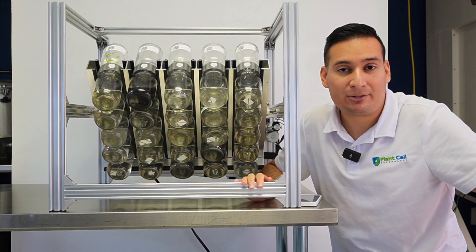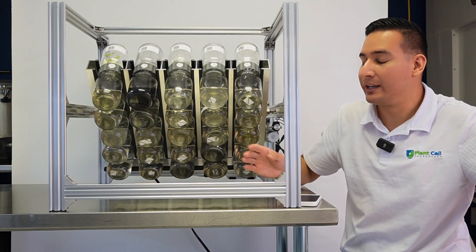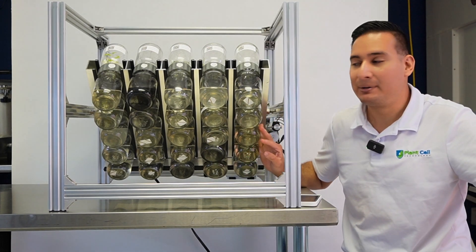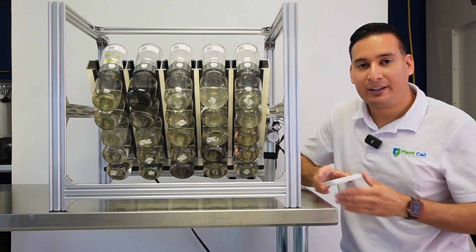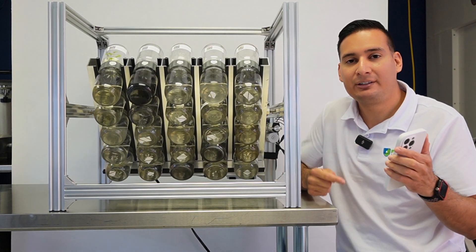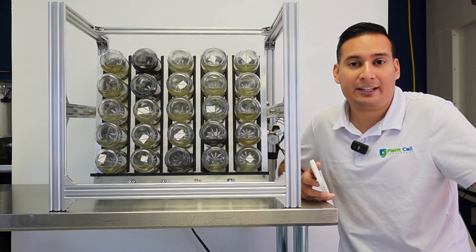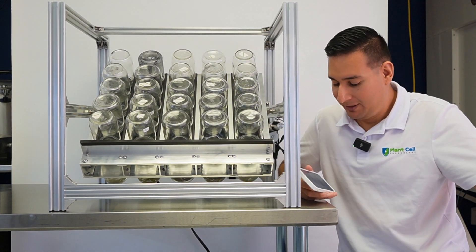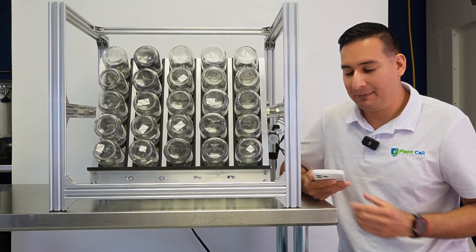In this configuration you can fit up to 25 biocouplers with 16-ounce jars, and this is fully automated. I have my phone here — it works with an app. All I have to do is click a button, and look at that — it's flipping 25 temporary immersion bioreactor systems all at once. Then I click the button again and they come back.